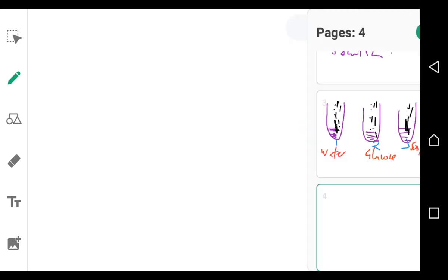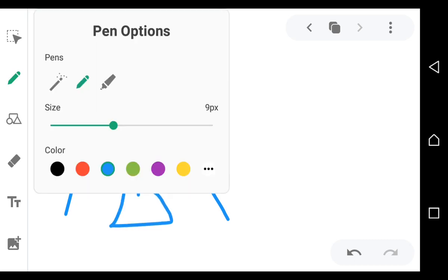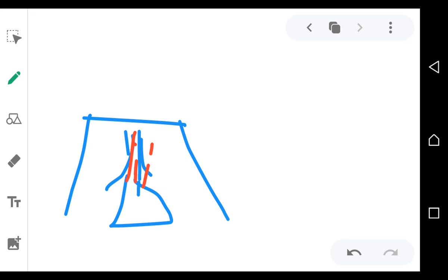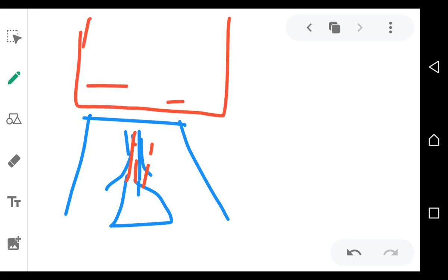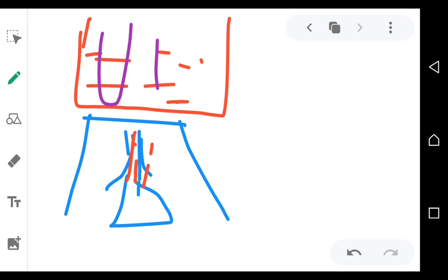you take the test tubes, you find a Bunsen burner and a tripod stand. So you find a Bunsen burner burning with fire like this, and on top of the Bunsen burner there is a beaker filled with water. In here there is water which is boiling. You take the 3 test tubes, you put them in the beaker, you let them heat in the water, and then look at what will happen to the color change. Boil them for at least 3 minutes.